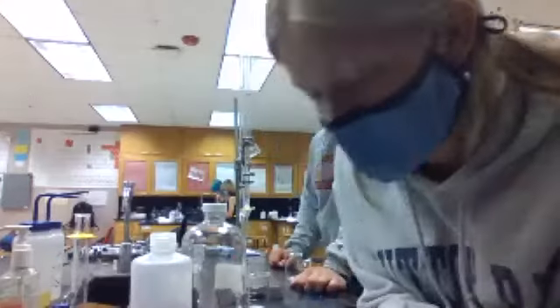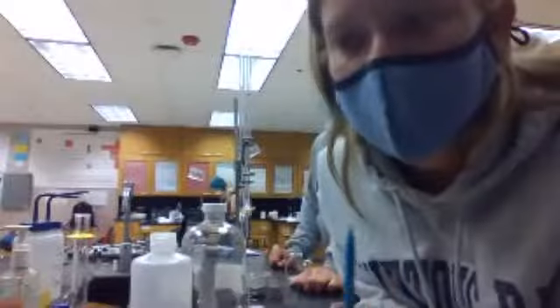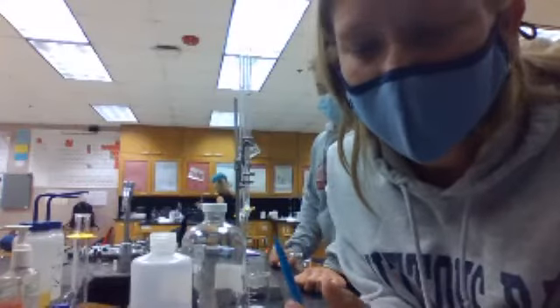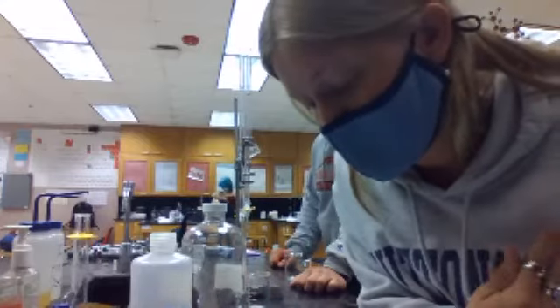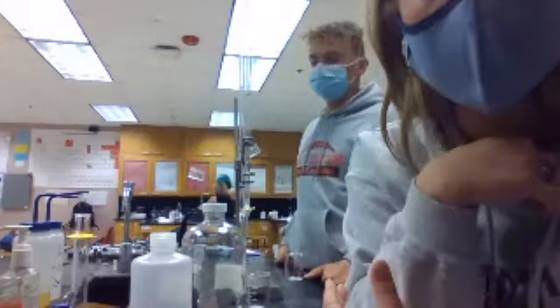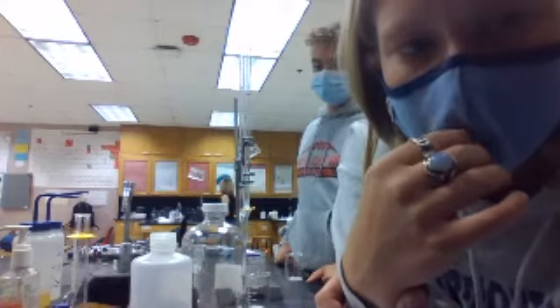Okay, so I thought it was 28.4. It's 28.40. Yeah, okay. So basically, when we get to the pH of 7, when I keep taking the pH of the acid and the base combined, that's when we write the final volume of the base, but we keep going to make the graph curve. Does that make sense? So we keep adding it. Do we have to make a new graph on the 4th page to keep up with the data or no? No, just keep adding the numbers into the graph on the document.